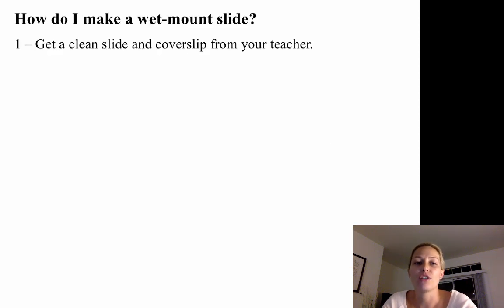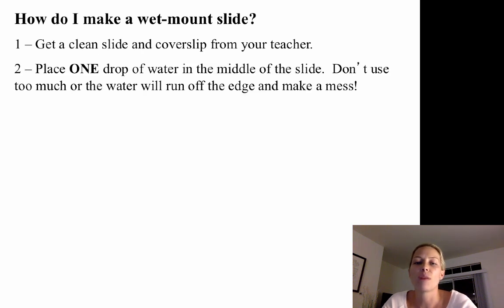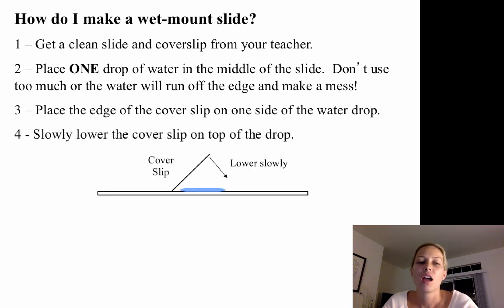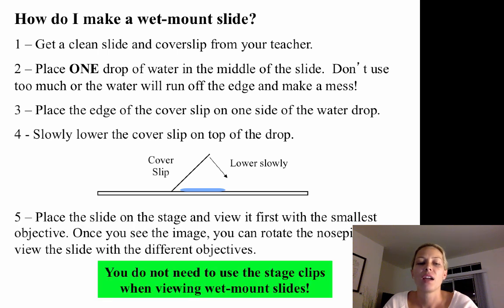How do you make a wet mount slide? First, get a clean slide and cover slip. Place one drop of water in the middle of the slide — don't use too much or it will run off the edge. Place the edge of the cover slip on one side of the drop of water, then slowly lower the cover slip on top. Place the slide on the stage and view it first with the smallest objective. Once you see an image, rotate the nosepiece to view under different objectives. There's no need to use stage clips when viewing a wet mount slide.